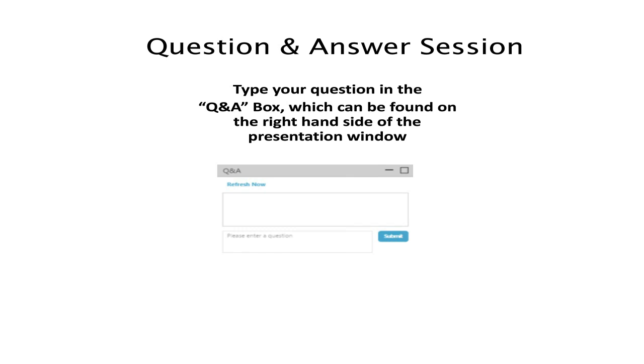Next question is, is there any maximum particle size limit for using IR microscopy for microplastics? There does come a point where there really is not a benefit to using the infrared microscope for the analysis of the particle. Now, part of that depends on the sampling technique which is used. I have seen examples where transmission measurements are performed with microplastics on a potassium bromide disk. In that situation, the upper limit is really the thickness at which the infrared bands which are useful for identification are becoming saturated.